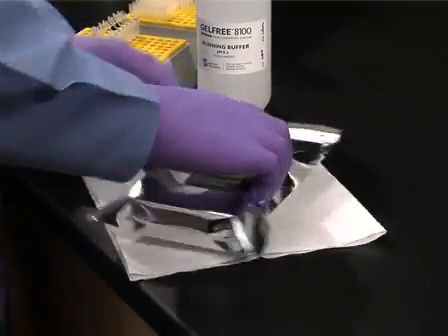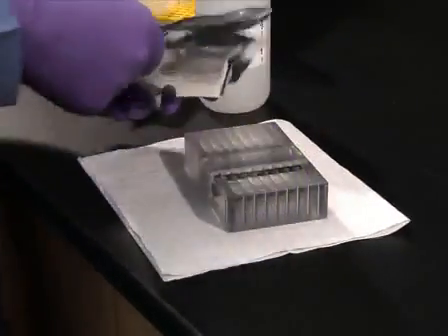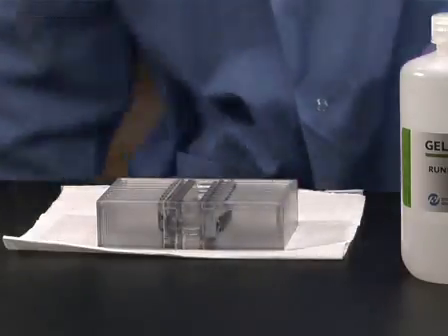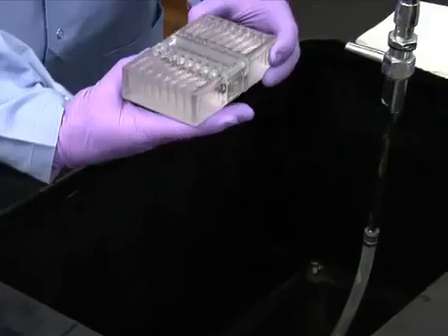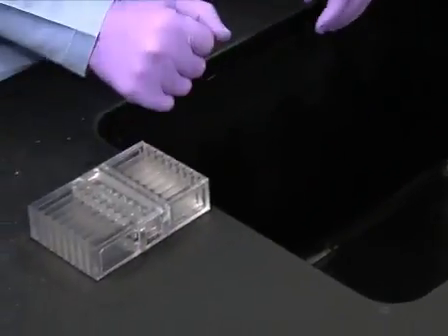While the samples cool, remove the GelFree 8100 cartridge from the foil pouch. Remove and discard the plate sealer. Remove the storage buffer from the cartridge compartments using a pipette. If all eight chambers of the cartridge will be used, invert the cartridge to drain the storage buffer from the compartments.